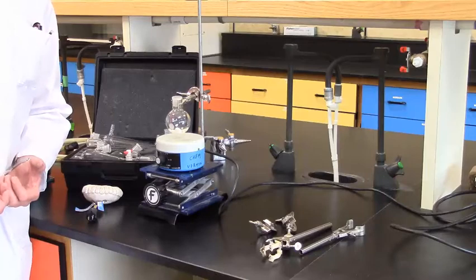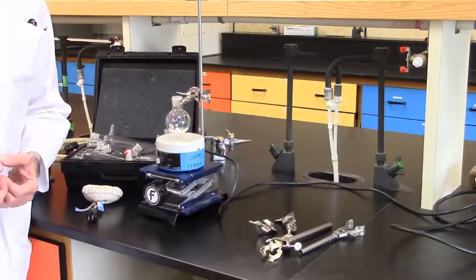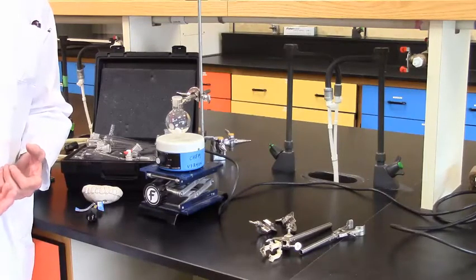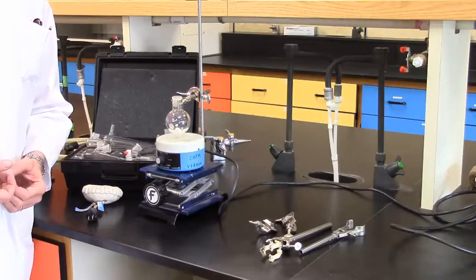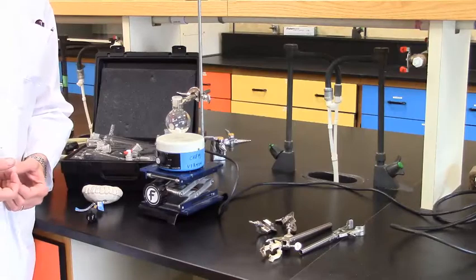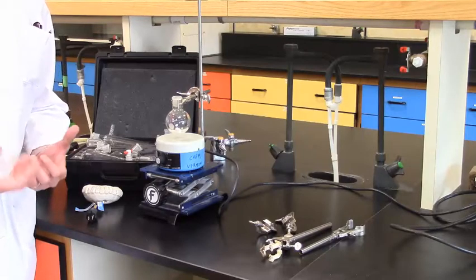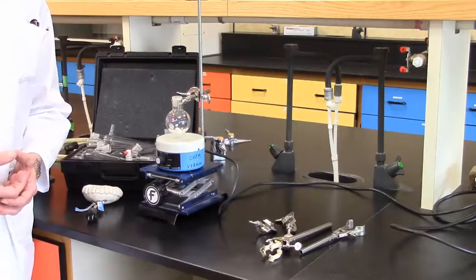Heating these solutions causes their own specific set of problems. Flammability is an issue, as well as vapors that would really make the lab quite uncomfortable. But it is a necessity in a lot of our experiments, so we have very specific ways of dealing with these volatile solvents.